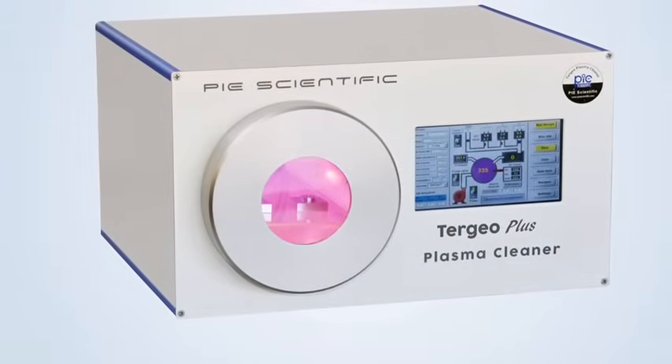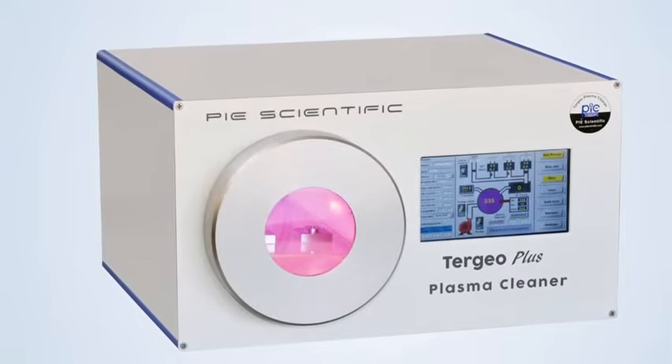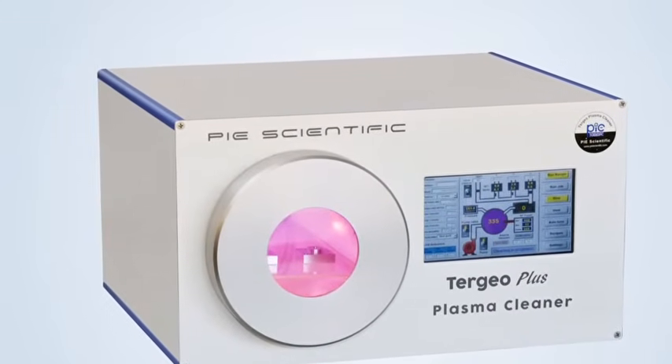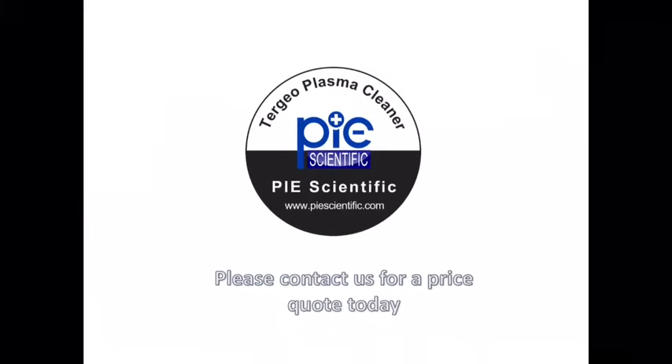Fully automatic operation and advanced process control technology helps Tergeo Plasma Cleaner achieve consistent and repeatable results for scientific research and industrial production applications. PIE Scientific is dedicated to bringing the latest plasma technology developed in semiconductor and nuclear research into affordable plasma instruments for research communities and industrial customers. Please contact us for a price quote today.